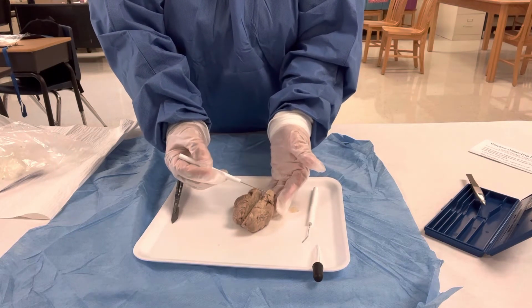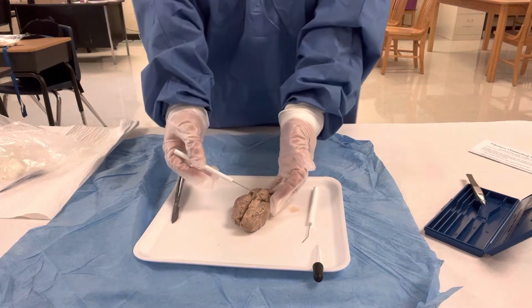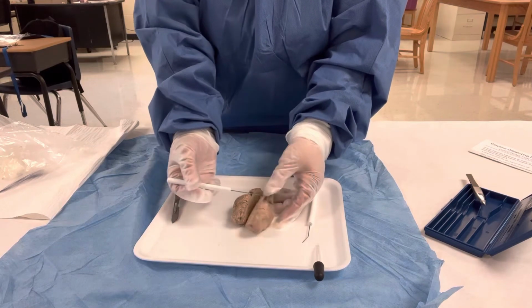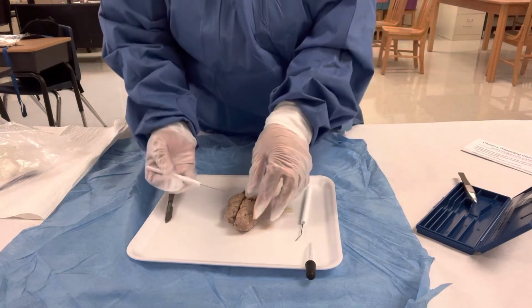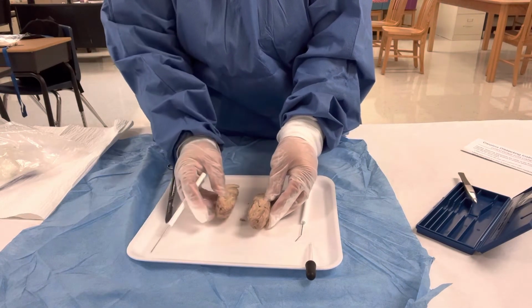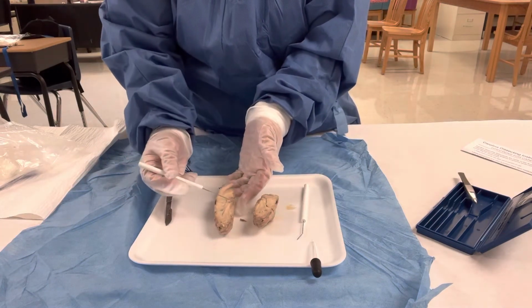The occipital lobe receives and interprets visual sensory messages. Let's see. Whew. The pineal gland is, this just doesn't look like it has all the pieces. It's like the dumb sheep, I guess.